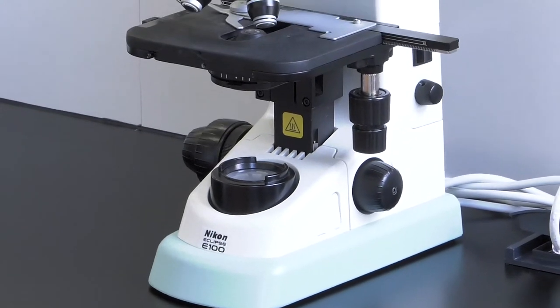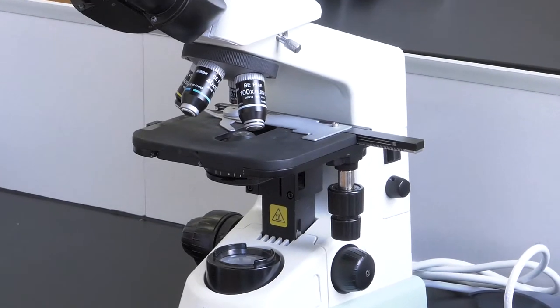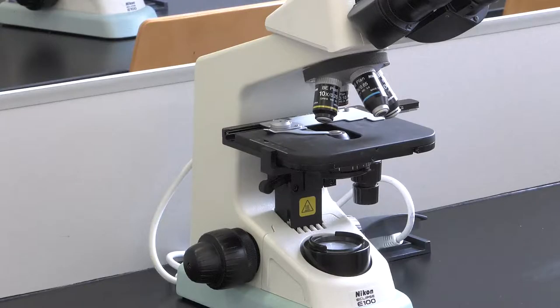The frame, which is also called arm, is another structural element of the microscope. It is located next to the base and supports other important elements of the microscope. The arm allows us to grasp the microscope safely for transport.